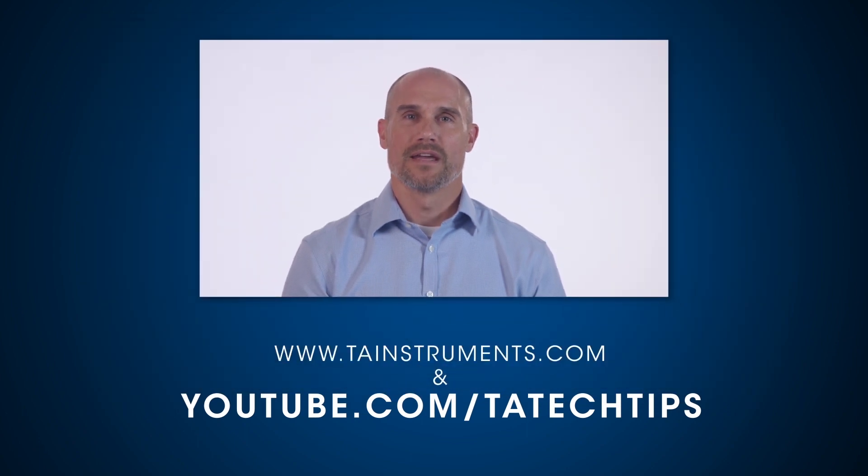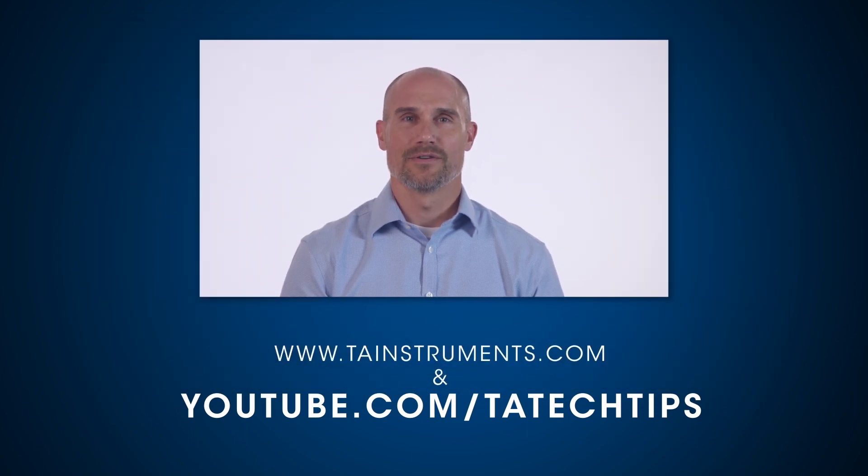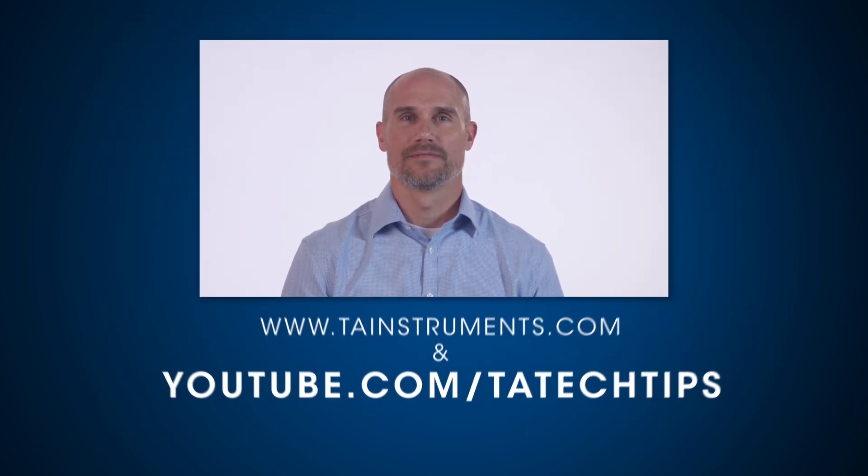In this tech tip, we went over the DMA application version 8 for ElectraForce. Please stay tuned for more helpful tips from TA Instruments, and thank you for your interest.